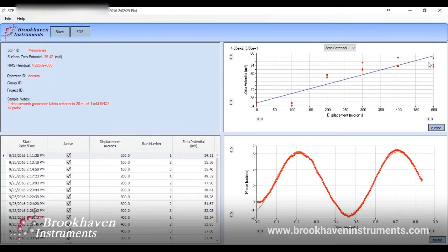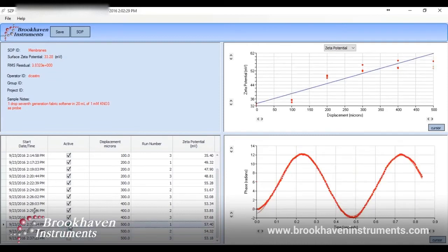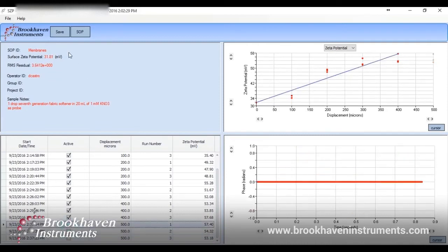From there, all of the data is saved and the surface zeta potential is extrapolated from the linear relationship of zeta potential versus displacement. If there are any outliers at any displacements, you can easily take them out of the calculation by unchecking the box. Our results have shown a positive zeta potential of 31.81 millivolts with nice repeatability at each displacement.